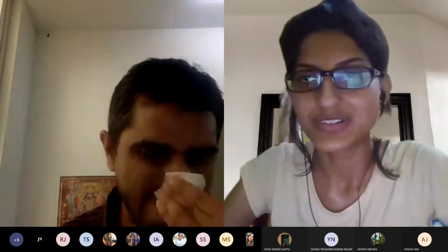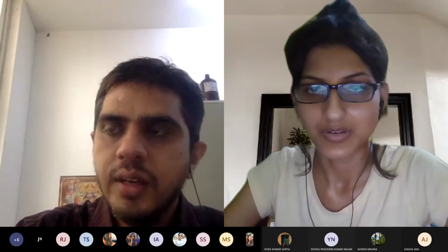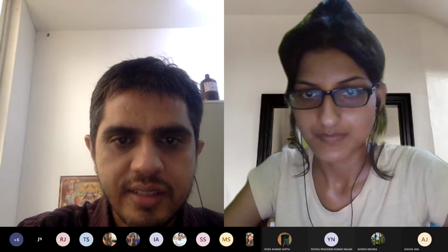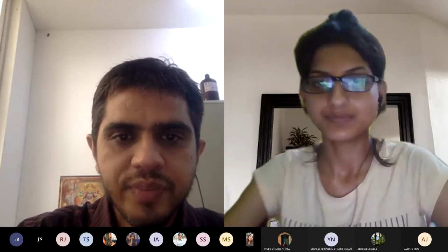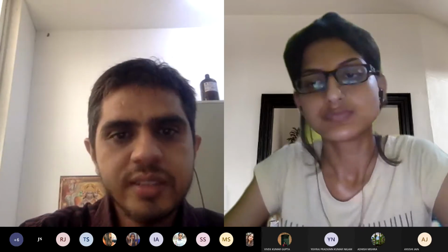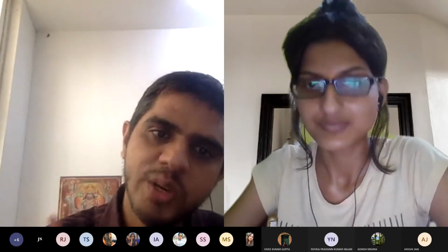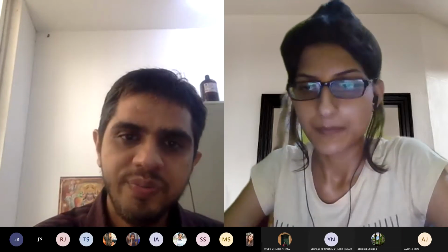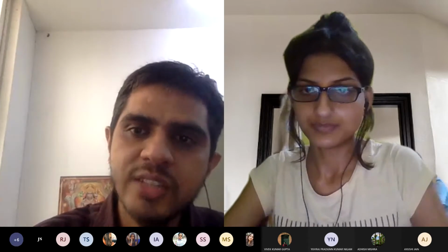Oh, sorry, sir. So when we switch it on, we don't get a null reading? See, we will get the null reading, but that null is of air. Whenever a race is started, it is not started from the home. The race starts from a 0 point, and from this point onward you are being calculated. Runners may start running before, but it is not counted. So counting is from where we are going.